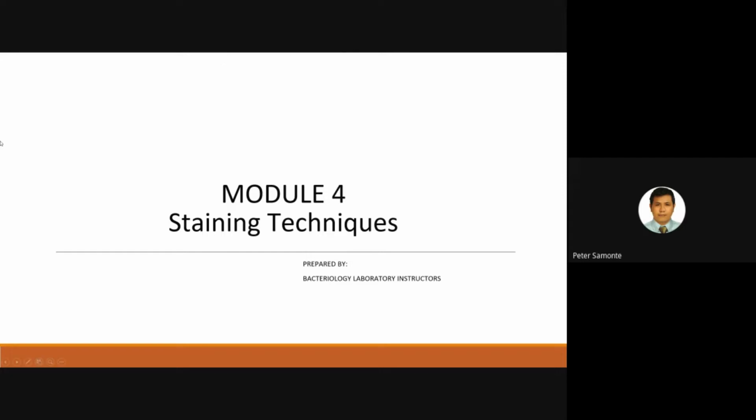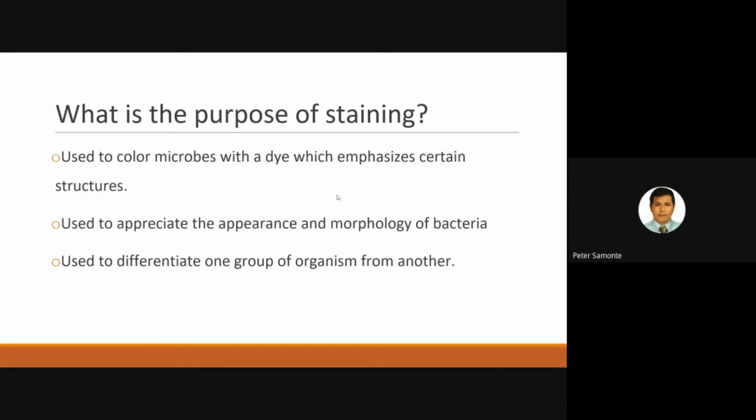So for today's meeting, class, since you have already discussed your smear preparation, we would be discussing one of the last two modules this midterms, which is your staining techniques. So after your smear preparation, class, you would proceed now to your staining technique. Now, your staining technique, class, has a very important purpose in which it is used to color microbes with a dye which emphasizes your structure.